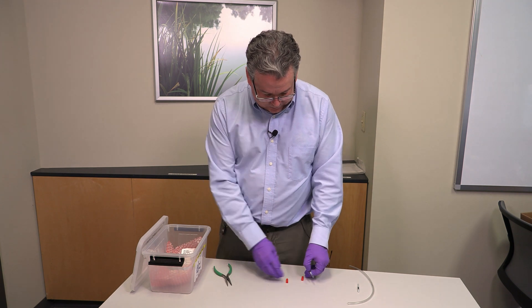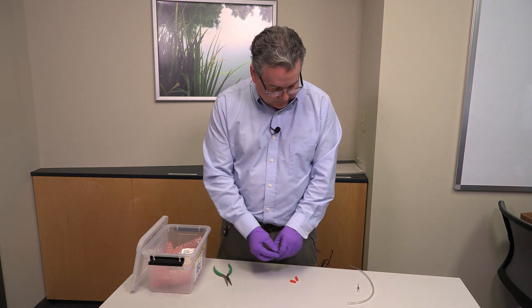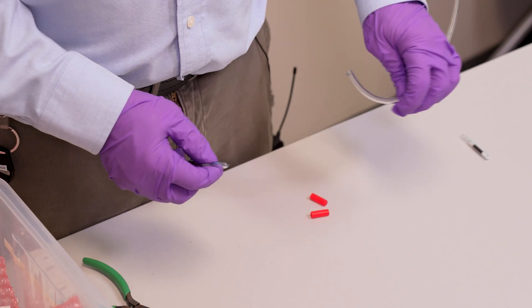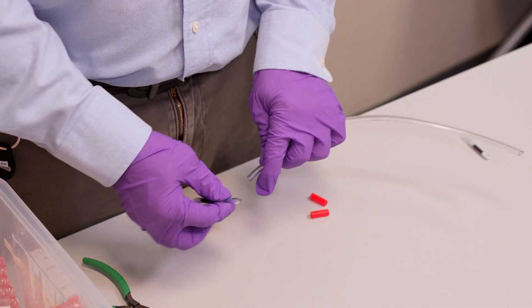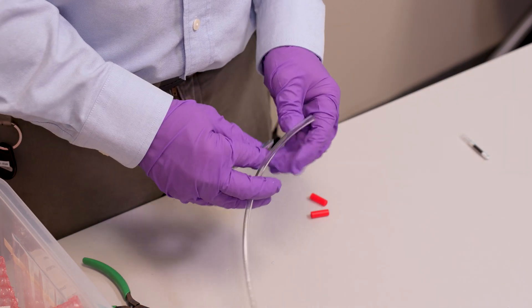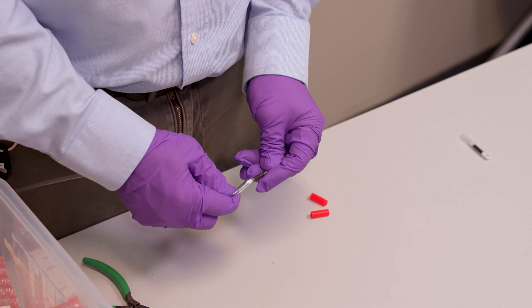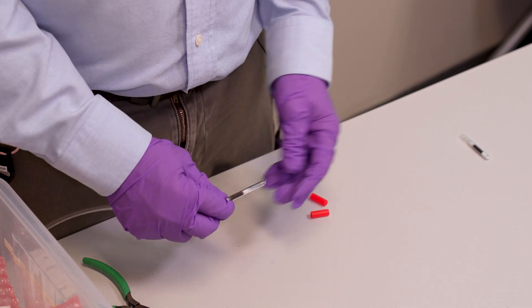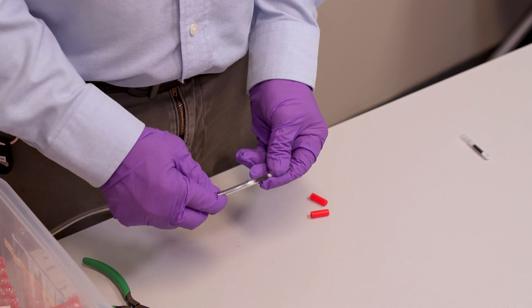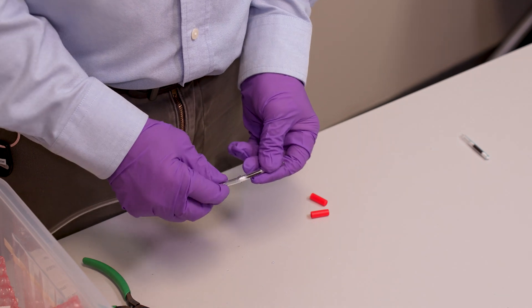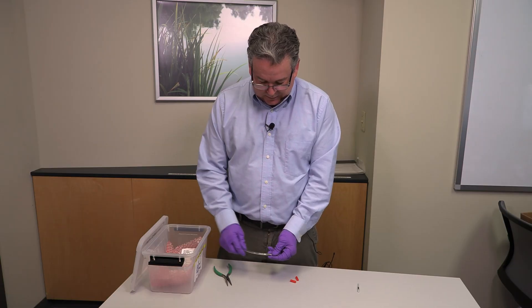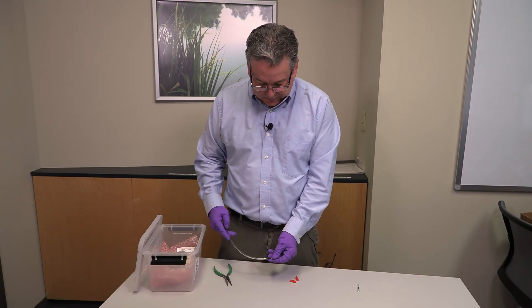At this point your tube is ready to hook up to your sampling pump. Your sampling pump will have a piece of tubing coming off the pump. You want to put that tubing so that the flow is coming through the pump, through the tube, in the correct direction. In this tube the arrow is pointing that way. The pump is going to pull air through the tube, not push it.